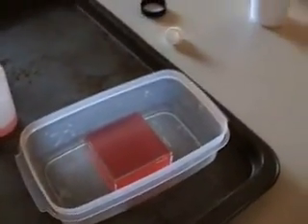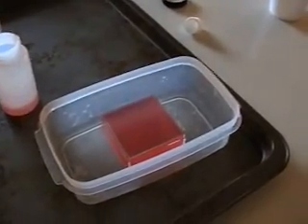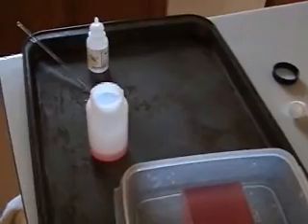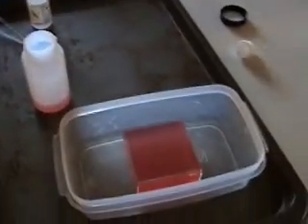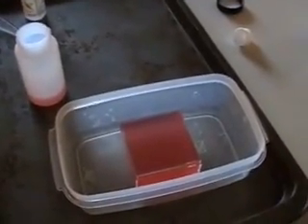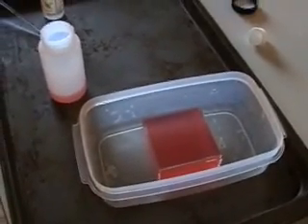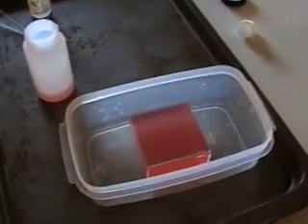Okay, you don't want to overfill it. You want to make sure that you have not spilled over the lip. You will have some left in the vial, which is fine. Now, you do have 2 vials, so if there is a problem, you can redo this if your gelatin, your agar, does not set up like gelatin.